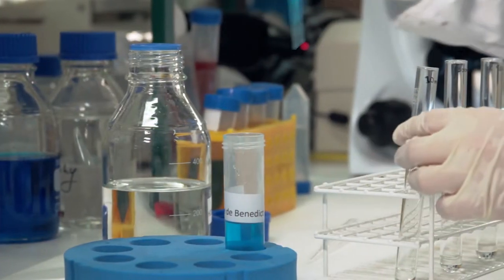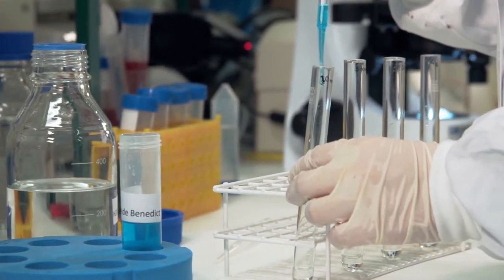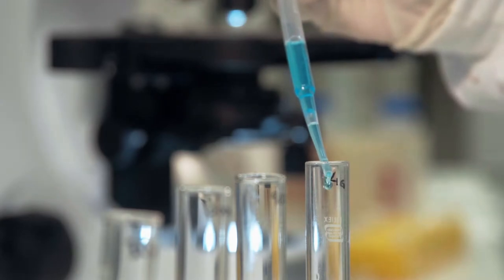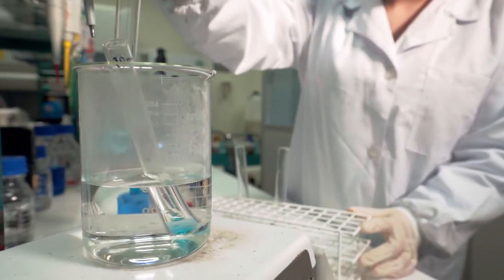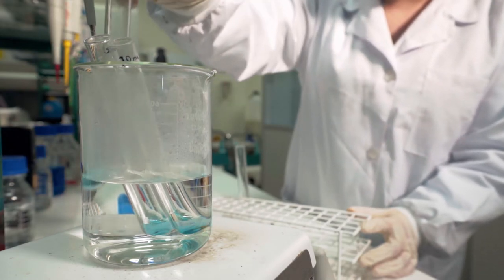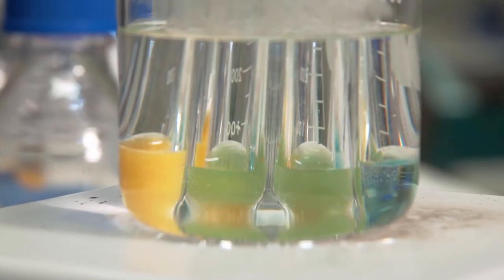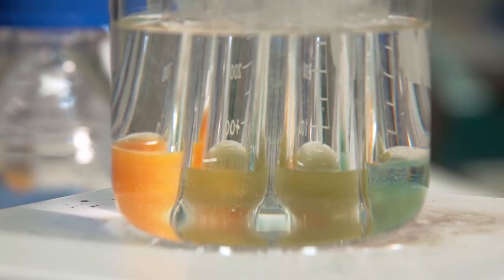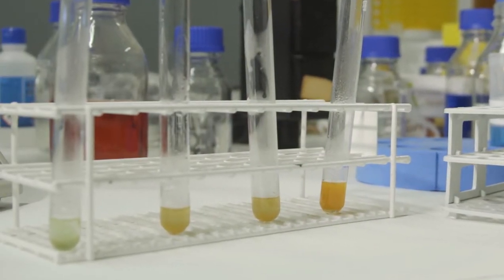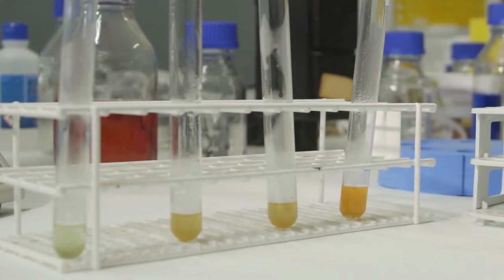Em seguida, adicionamos 10 gotas de reagente de Benedict a cada tubo que preparámos anteriormente. Num gobelé grande, colocamos água até metade e aquecemos até levantar fervura. Colocamos os tubos em banho-maria até se verificar uma mudança de cor. Com os tubos ordenados por ordem crescente de concentração de frutose, construímos uma escala de cor.